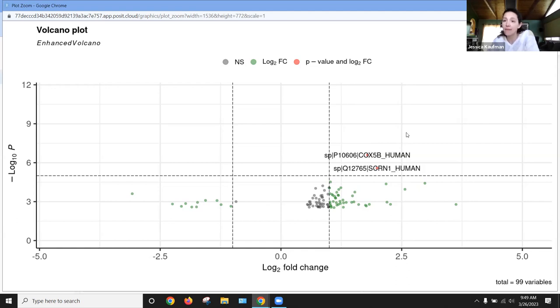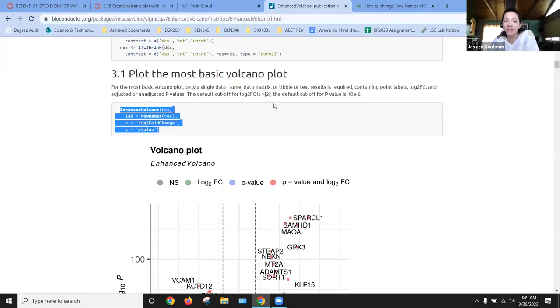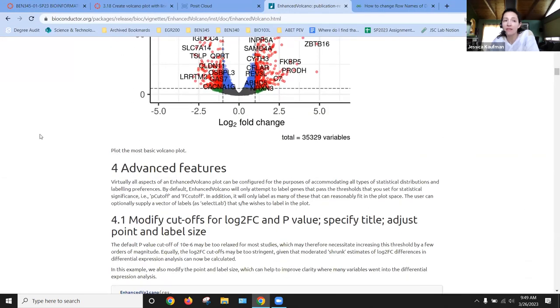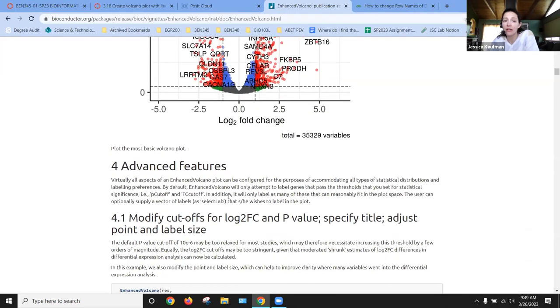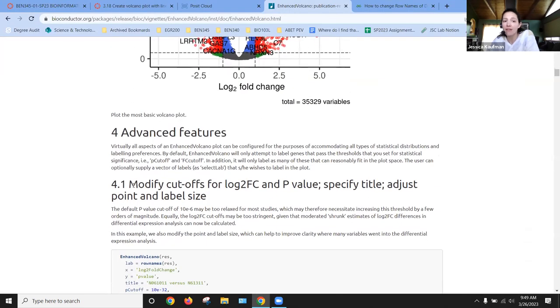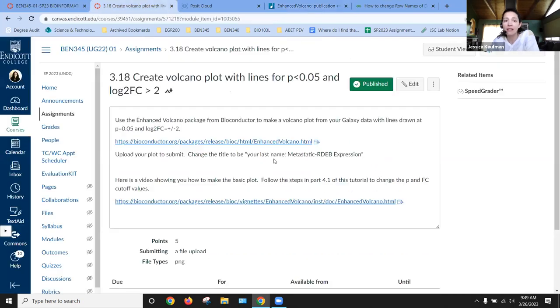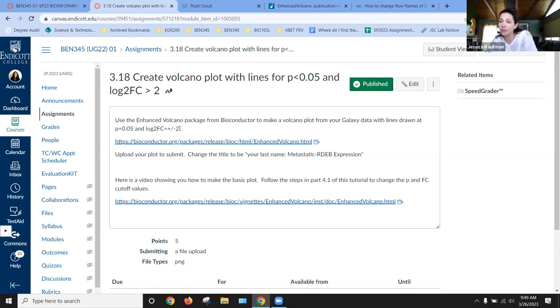To finish this assignment, you're going to go to the next part of the tutorial and modify the cutoffs for log2 fold change and p-value. So in the assignment, I ask you to change them to be p-value is 0.05 and log2 fold change is plus or minus two.